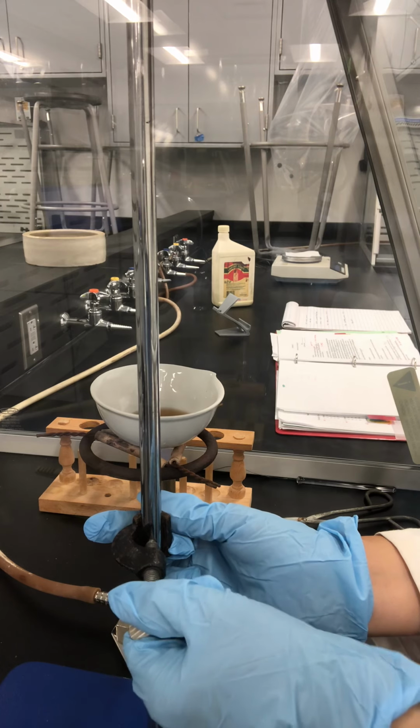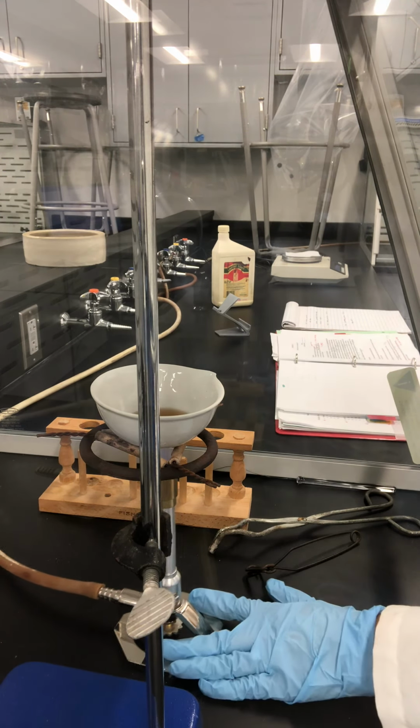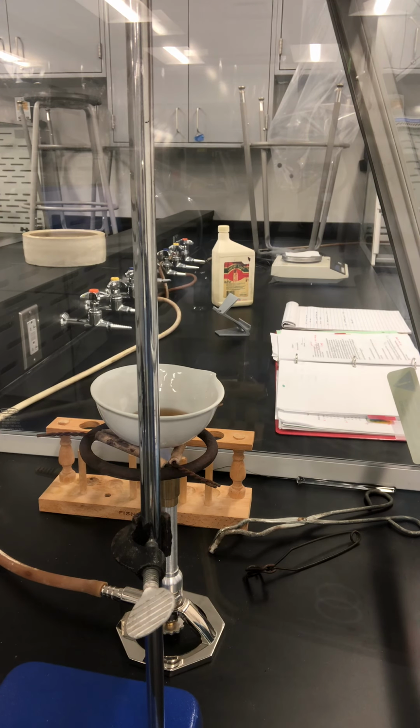Why do we perform this in a fume hood? That is because it's gonna generate some smoke, and the fume hood will take care of the smoke produced during this experiment.